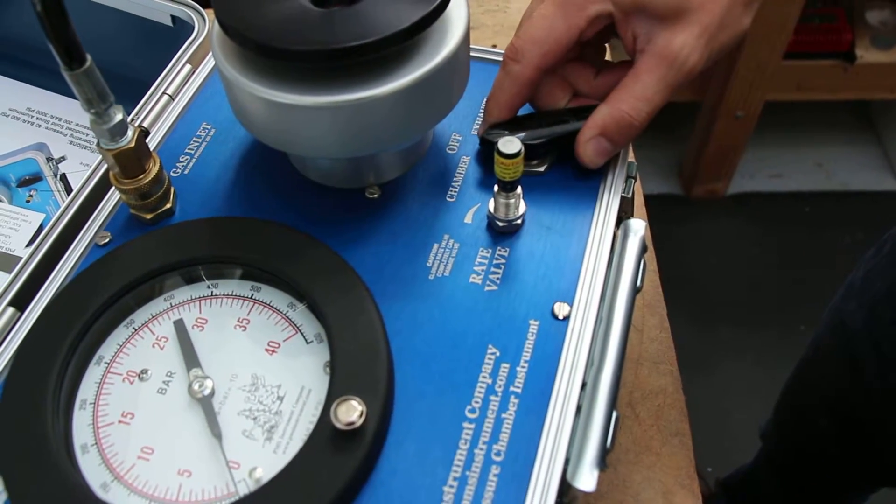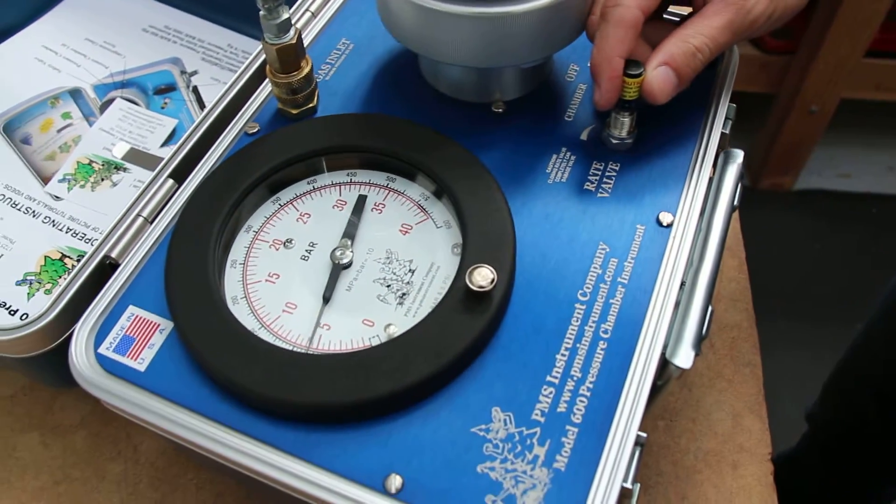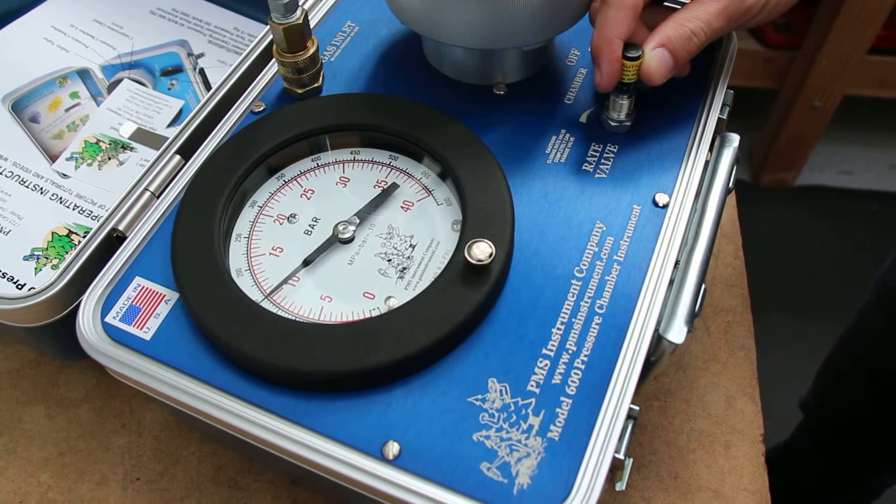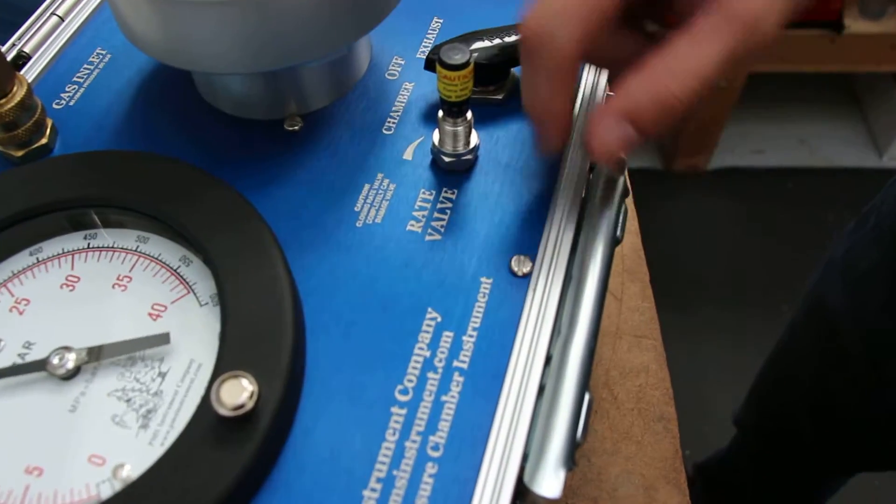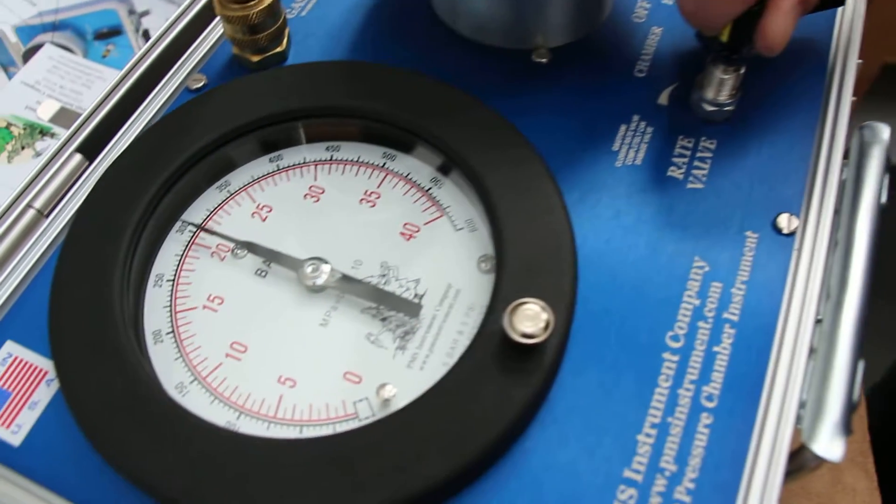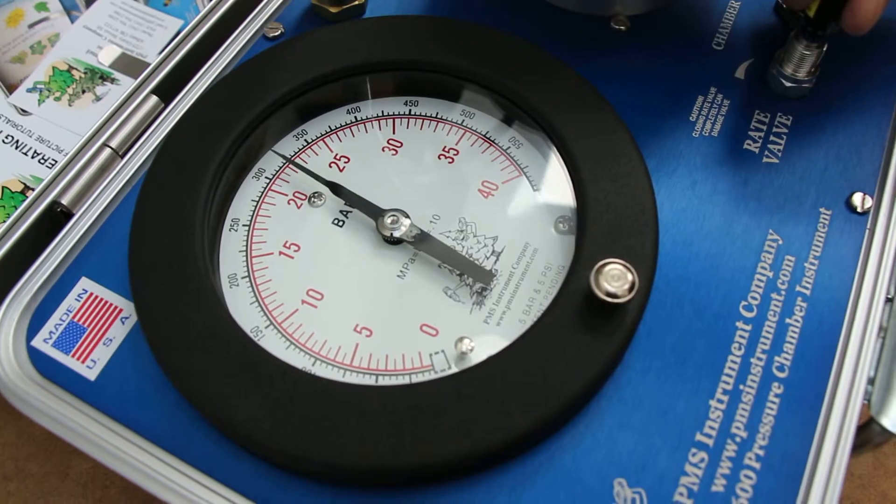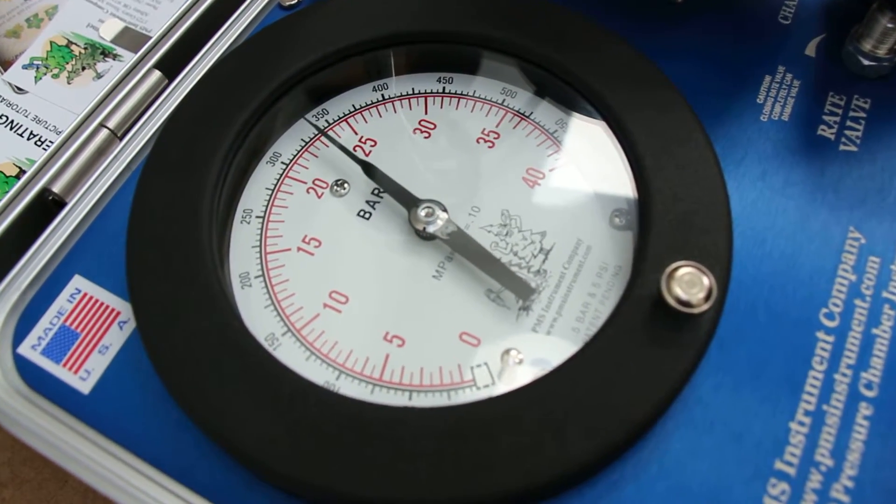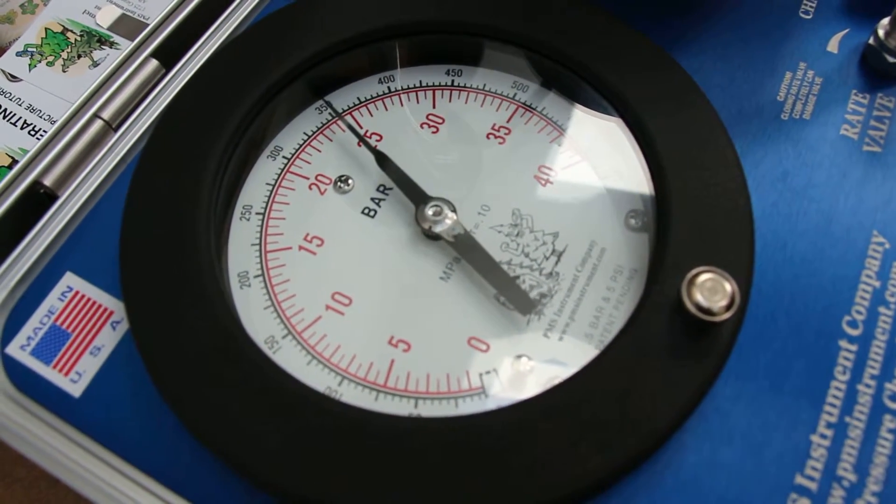Now we're using the rate valve. Tighten it clockwise to slow the rate of pressure into the chamber. What we would like to achieve is about half a bar per second.